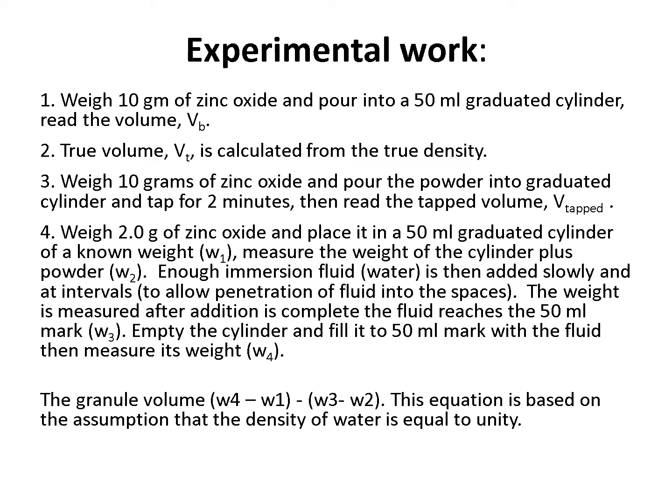Just imagine that W4 minus W1 is the weight of water.